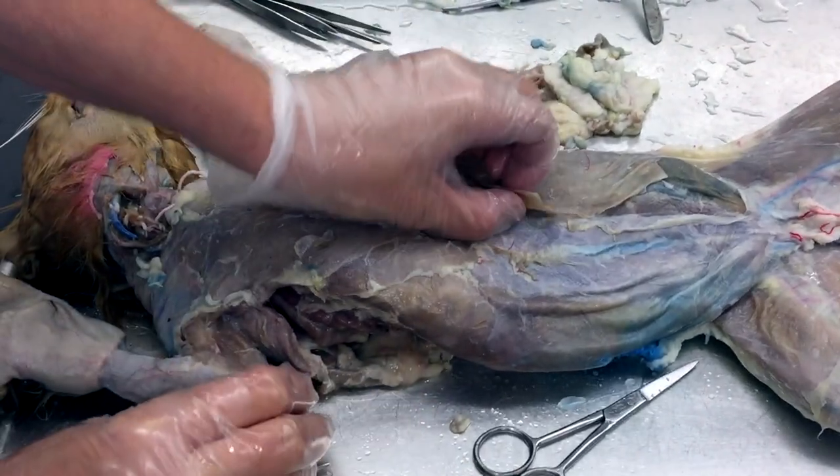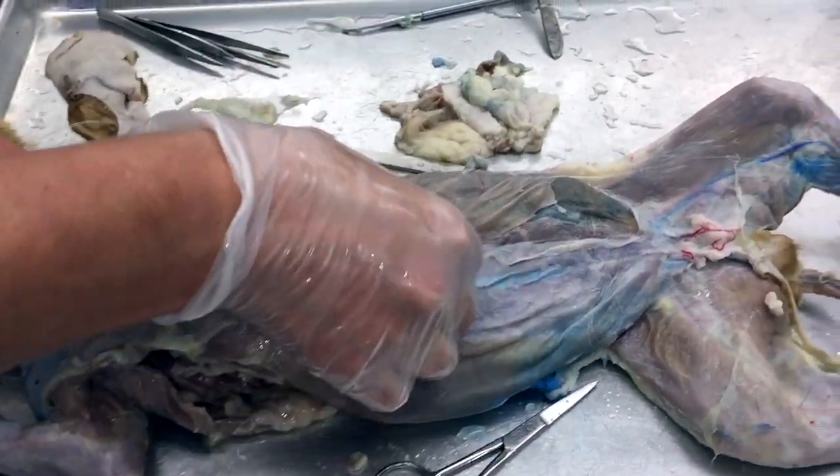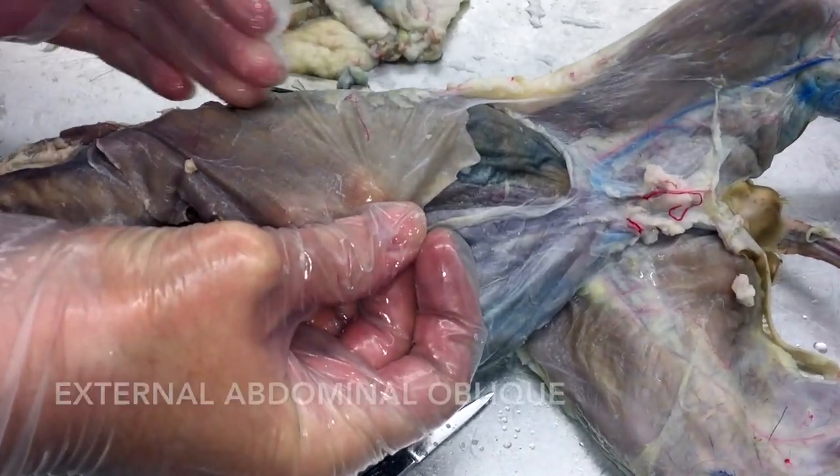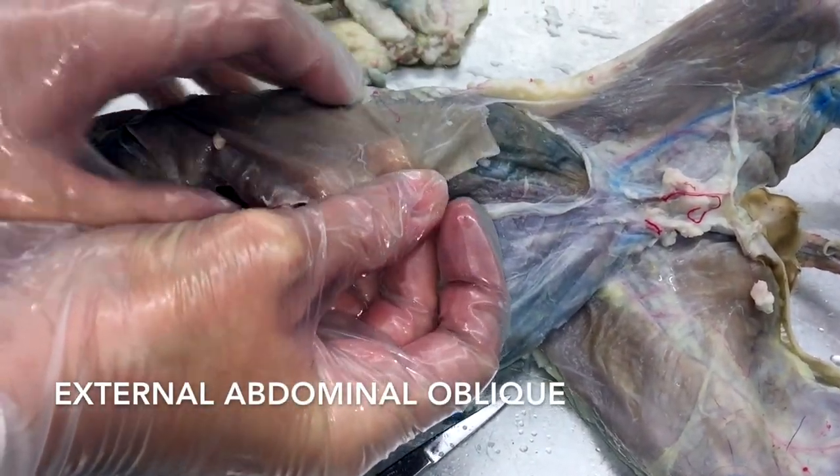Alright guys, here's your cat video. Starting in the abdomen — the outermost layer of muscle is this one here. If you look at the direction of the fibers, they go this way. That's going to be your external obliques.